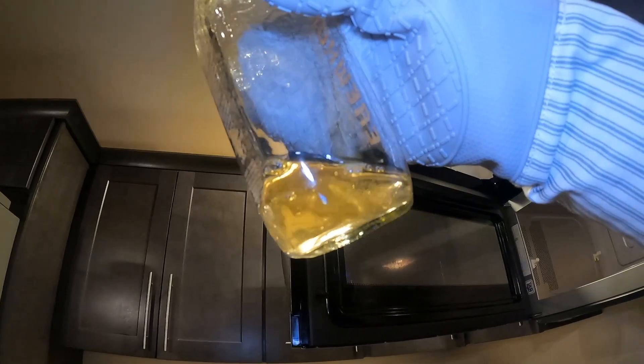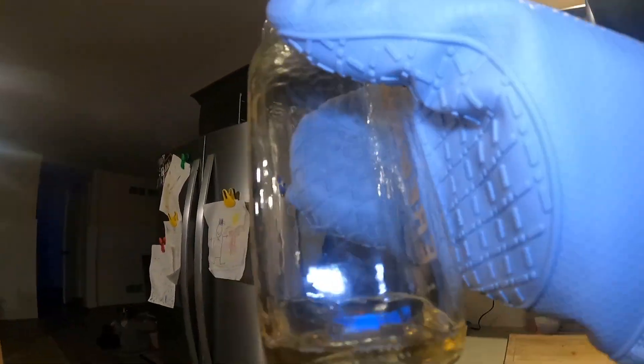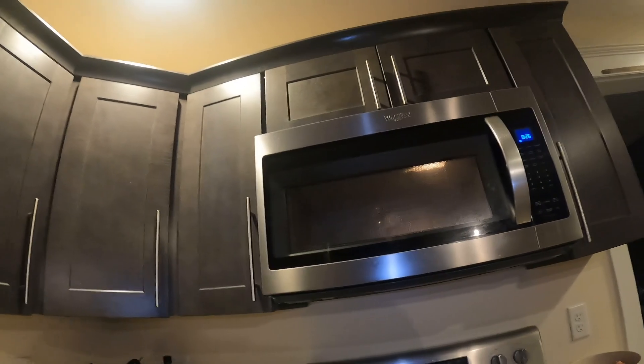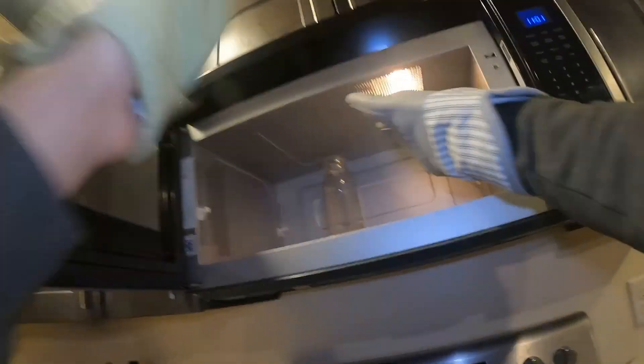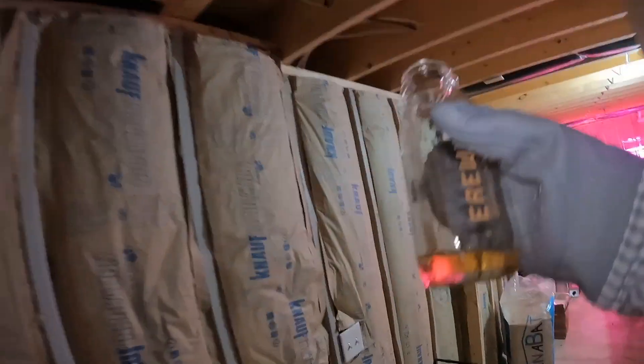The first time I pulled it out I noticed there was still a little bit of agarose on the sides, so I swished it around to get it off the sides. You want your agarose to look all glassy and clear whenever it's mixed, boiled, and hot, ready to go. I put it back in for about 30 seconds — it was super clear and glassy — and then I walked it down to the lab and poured it in the casting tray.